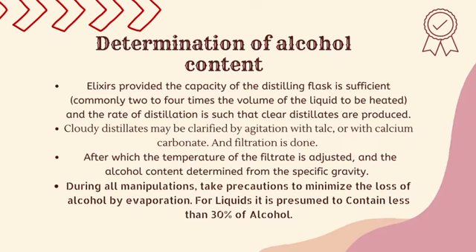During all manipulations, take precautions to minimize the loss of alcohol by evaporation, for a liquid presumed to contain less than 30% of alcohol.